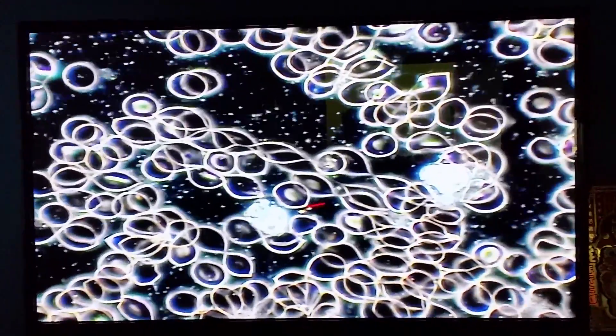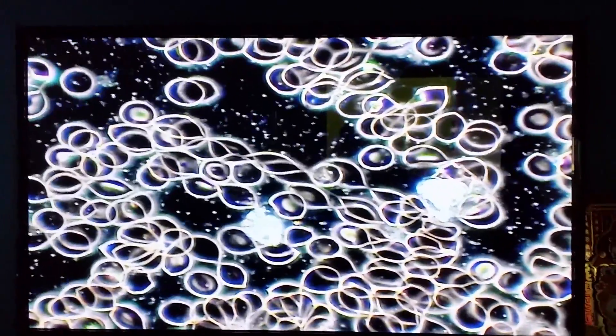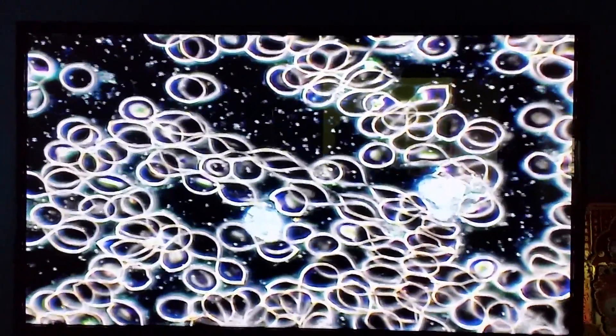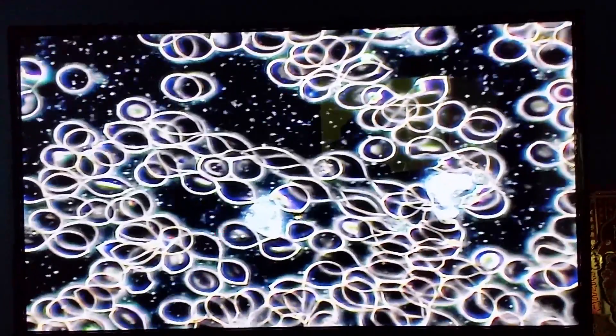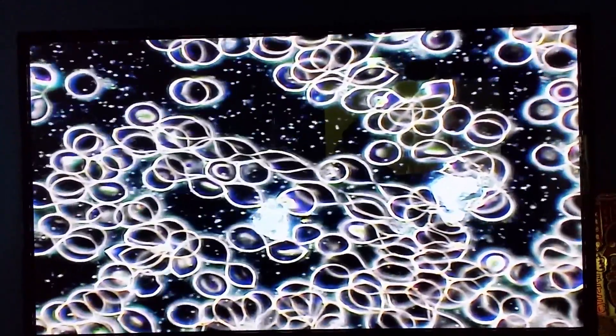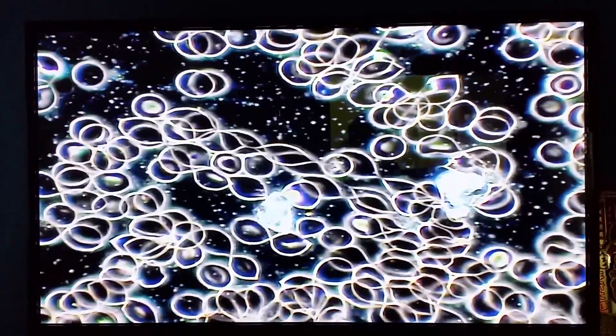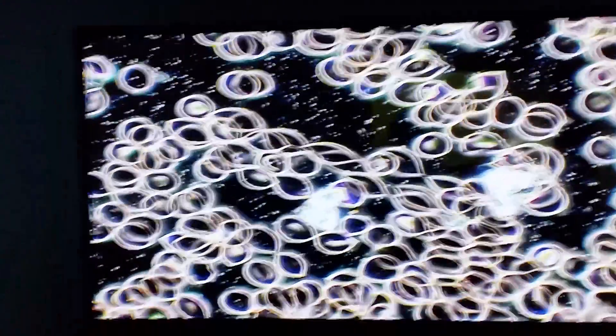Now, these two are white cells. They are called neutrophils. They are white cells that fight bacteria. Later on we're going to look around if there's any other types of white cells that I can show you. If we see cells that are normally shaped like this, there is an indication of oxidative stress, which means cellular lack of oxygen. Because your red cells are congested, your body cannot distribute the oxygen in your system.